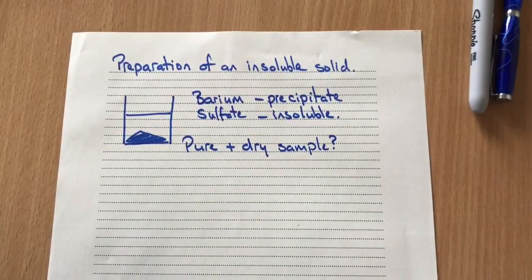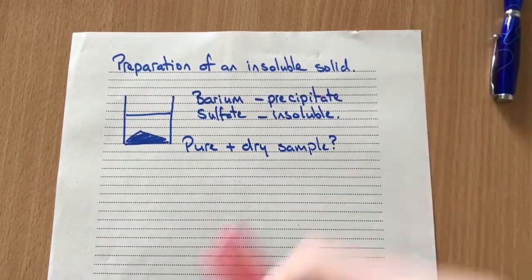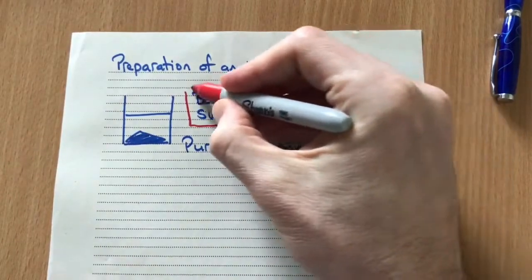Okay, in this video we're going to explain how to produce a pure dry sample of an insoluble solid. To do this takes a couple of steps. The first step is you would carry out a chemical reaction, which is often a precipitation reaction. So for example, here I'm trying to make a precipitate. My precipitate is going to be a chemical called barium sulfate.